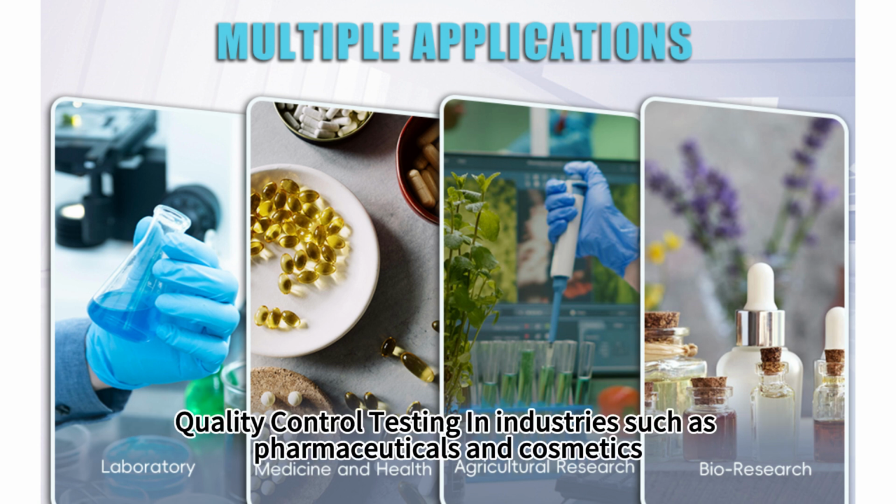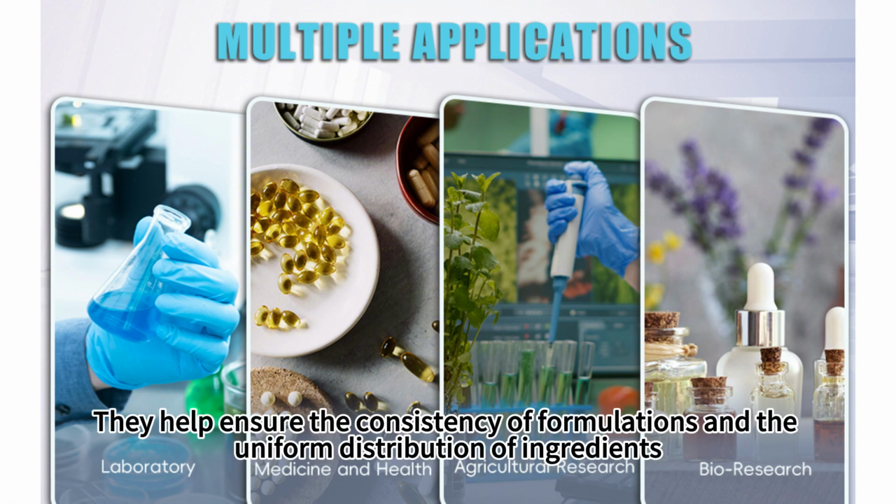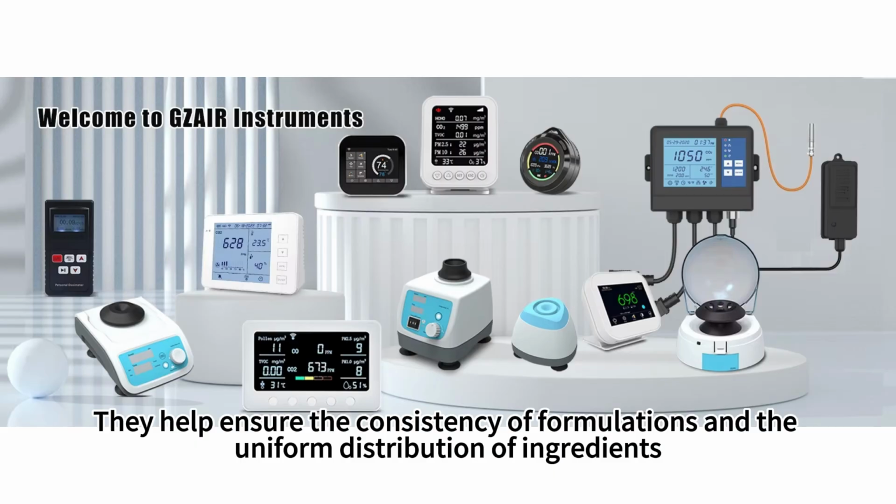Quality control testing. In industries such as pharmaceuticals and cosmetics, vortex mixers are used for quality control testing. They help ensure the consistency of formulations and the uniform distribution of ingredients.